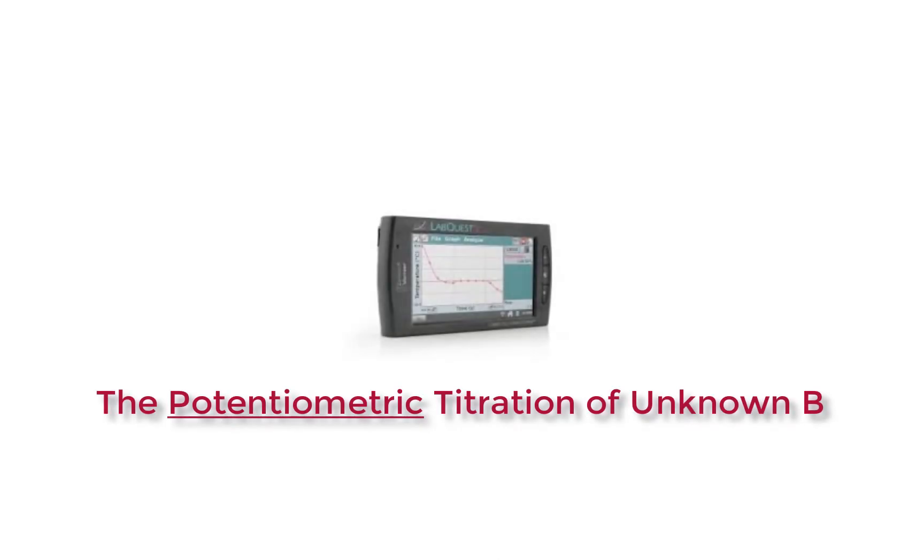In this video, we are going to show you how to operate the Vernier LabQuest 2 to complete the potentiometric titration of unknown B.